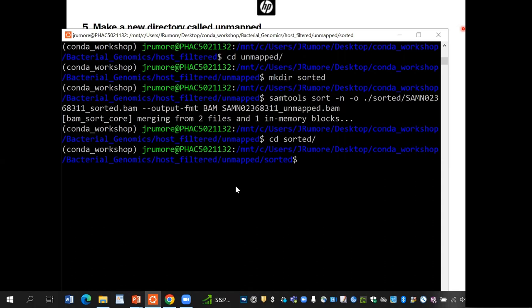Okay. Now we're going to run samtools fastq. There's a lot of options I should mention for converting BAM to FASTQ. I've chosen to use samtools today. There are other tools that you can use, such as bedtools, which is quite popular. So again, it's a personal preference. So we're going to add the -@ option, and that's just to speed it up with two threads. I'm not sure how fast that will speed it up, but we're going to try.